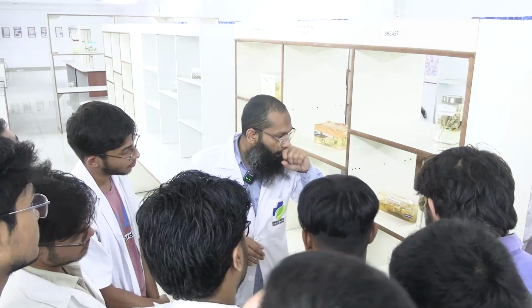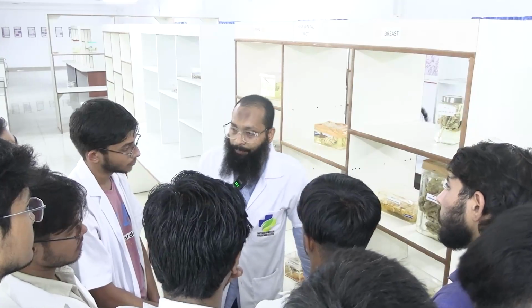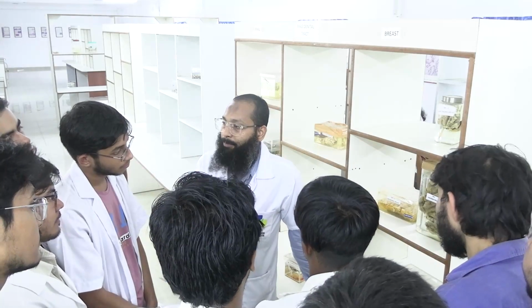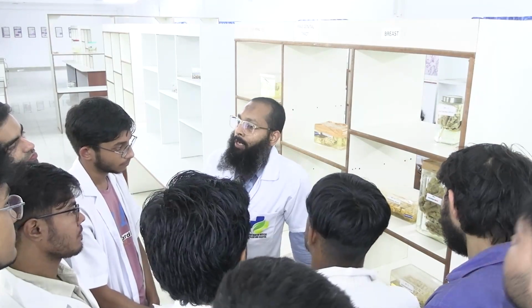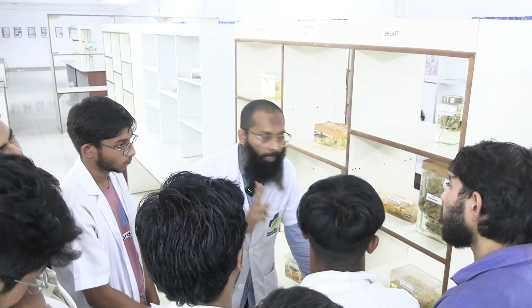Then you can describe whether it's well defined or ill defined. So under this point you have to describe that mass. Now you can say my provisional diagnosis is this is probably a specimen of carcinoma breast. Don't go and say this is an infiltrating breast carcinoma, no special type. There are two negative points in that.